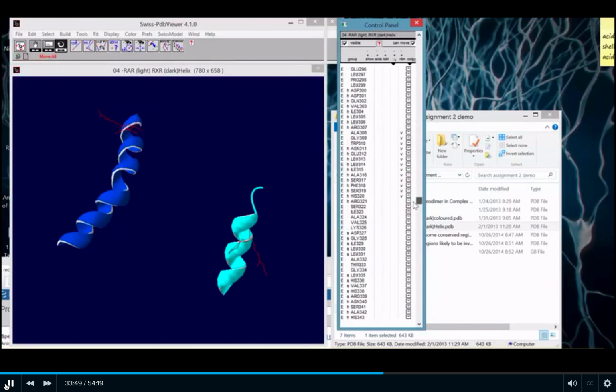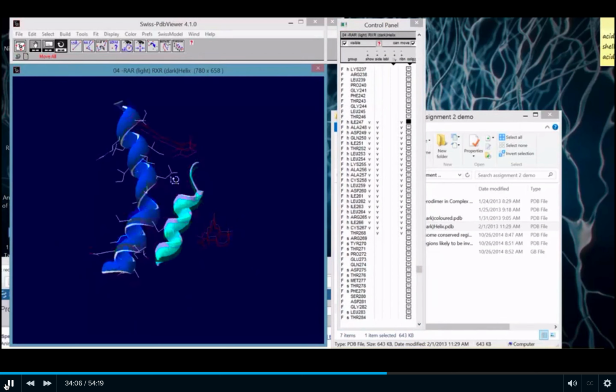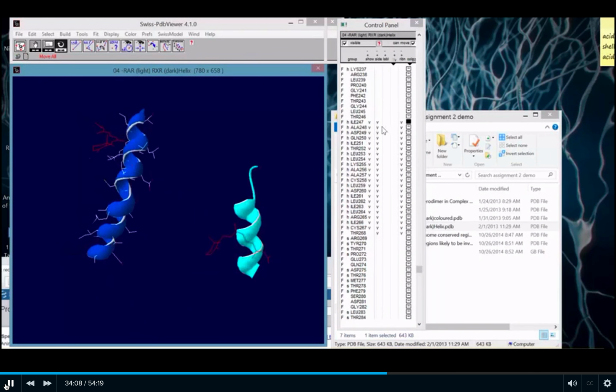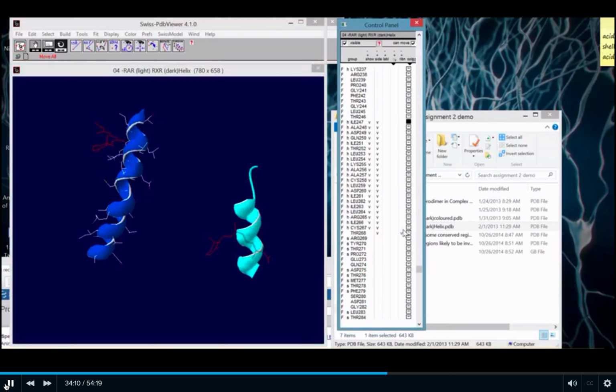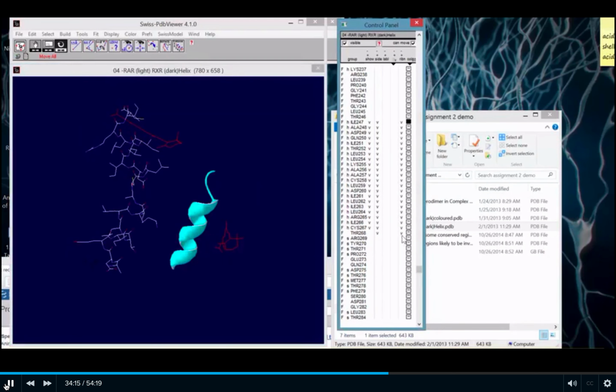So I'm going to go to that section that I've indicated on the helix. It's the wrong one. It's my light blue helix. I want the dark blue helix. Here it is. Because I'm now working on a very small scale, I can have all the residues and everything in place. And again, this is in the way. So I could hypothesize, and I'm going to just get rid of this for a quick second, that actually it's easier if I show it.